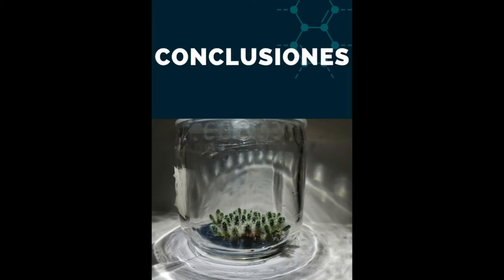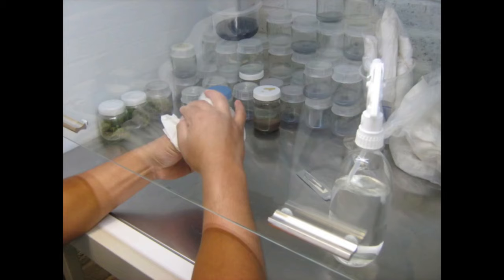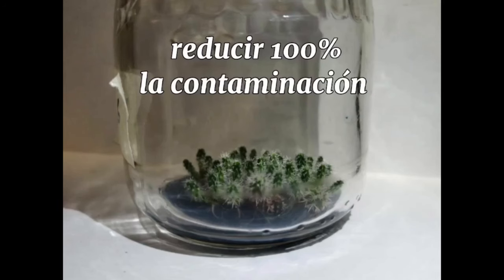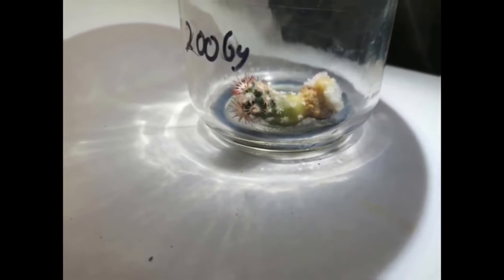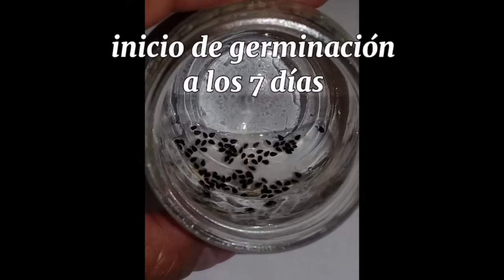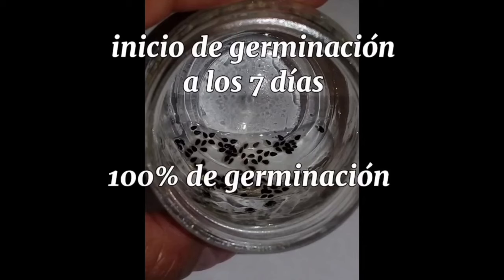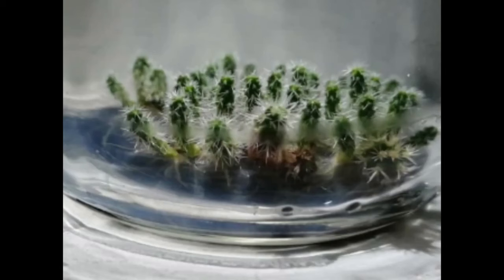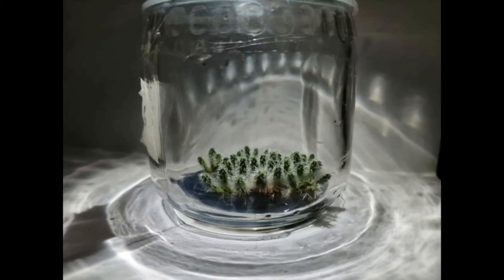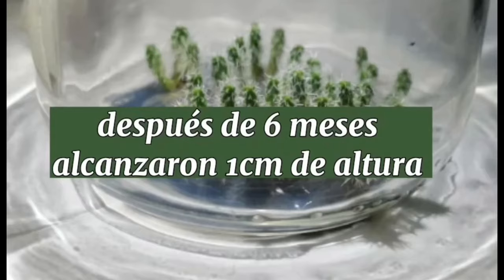Conclusiones. El protocolo de desinfección aplicado fue efectivo, ya que no se presentó contaminación. El uso del medio de cultivo al 25% reduce costos en el proceso de establecimiento. El uso de carbón activado en el cultivo reduce la presencia del gas etileno. La germinación se logró en 7 días y a los 15 días se alcanzó el 100%, mejorando tiempos y porcentajes con respecto a otros estudios. Las plántulas obtenidas presentaron características morfofisiológicas normales, registrando un centímetro de altura en 6 meses. Agradecemos la participación de María Elena Quintana Sierra con este video. Le pedimos por favor a la maestra Ruth López Pérez que nos haga llegar sus comentarios.